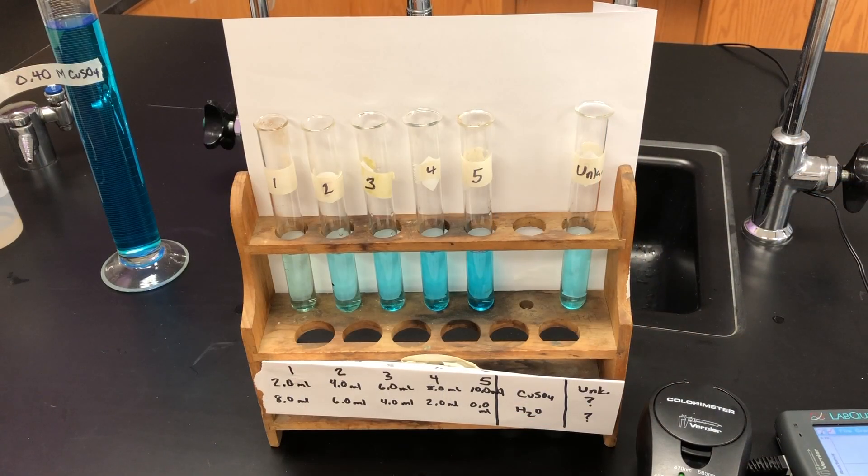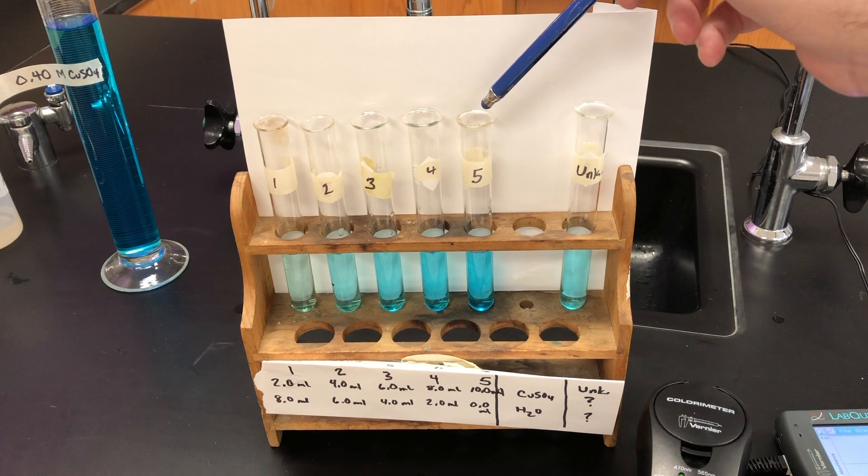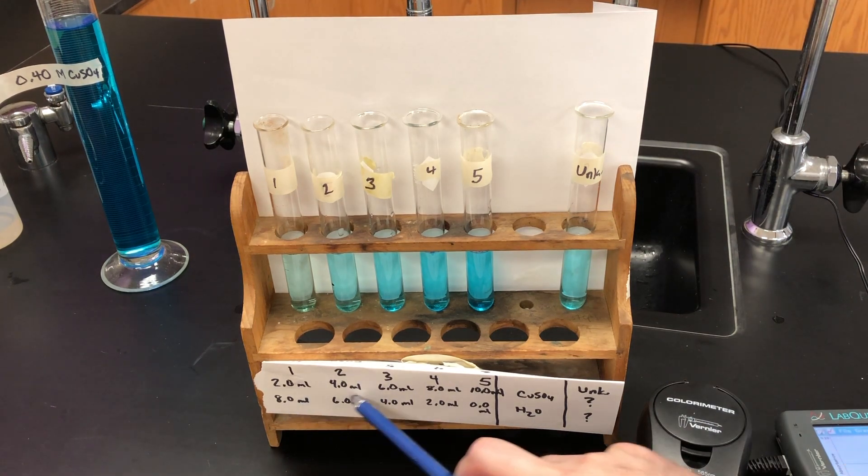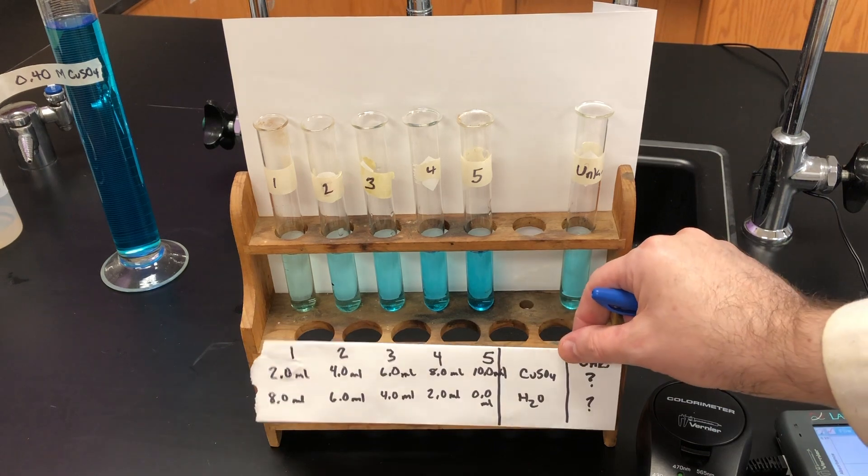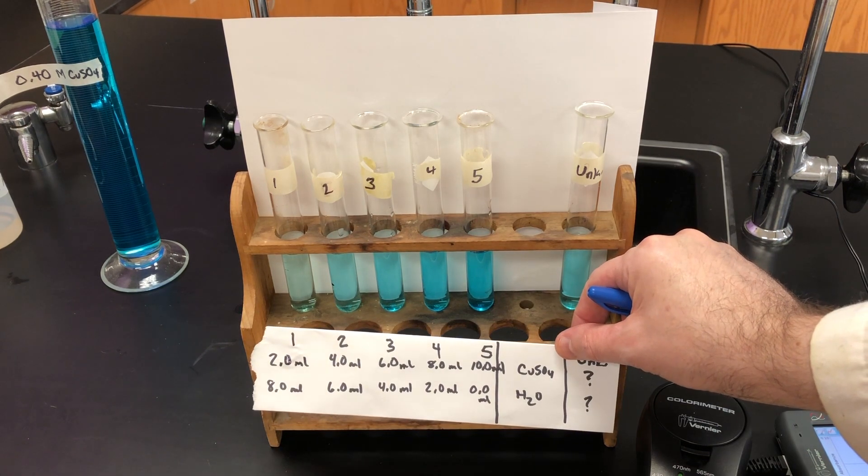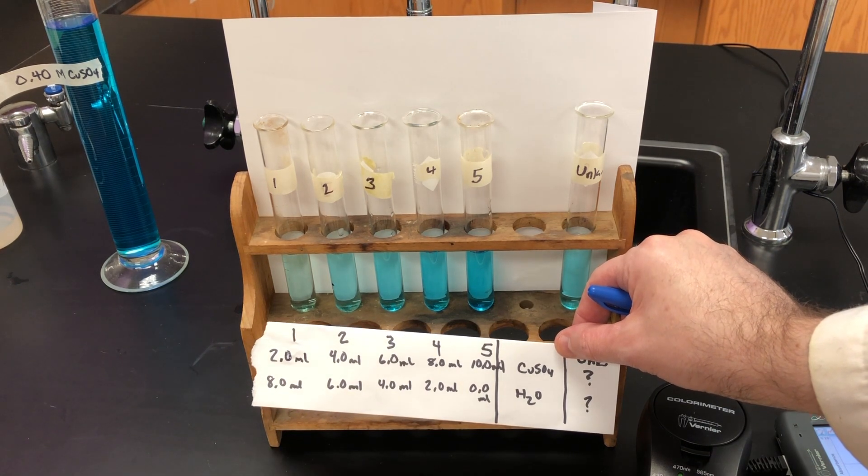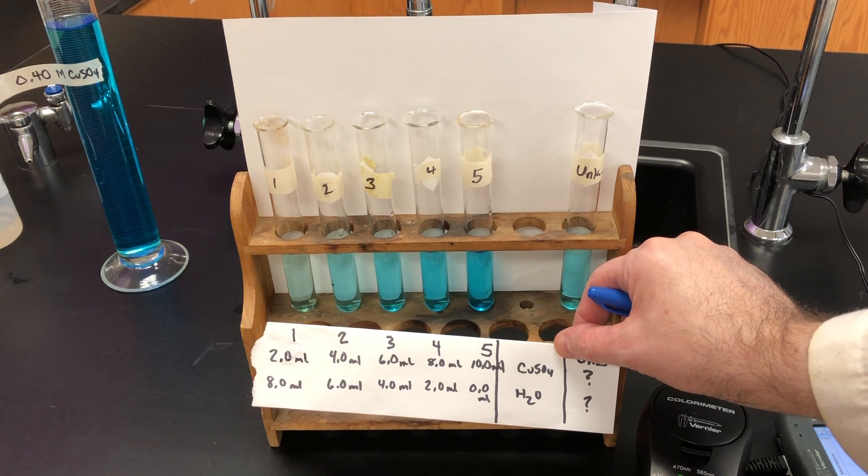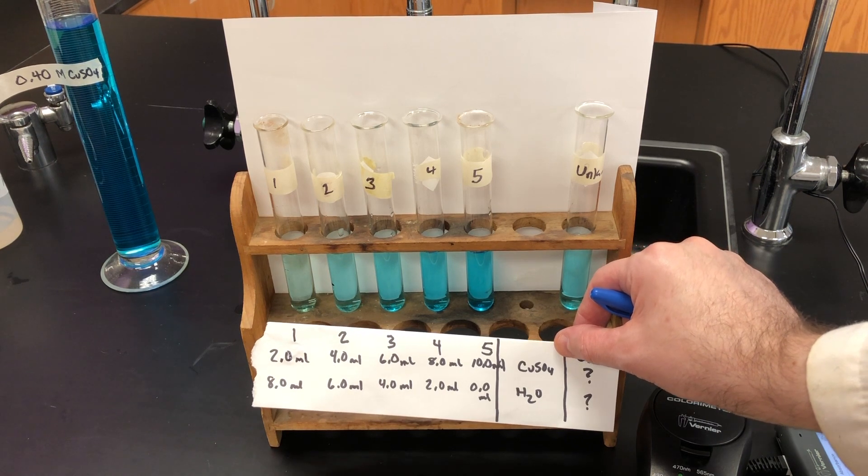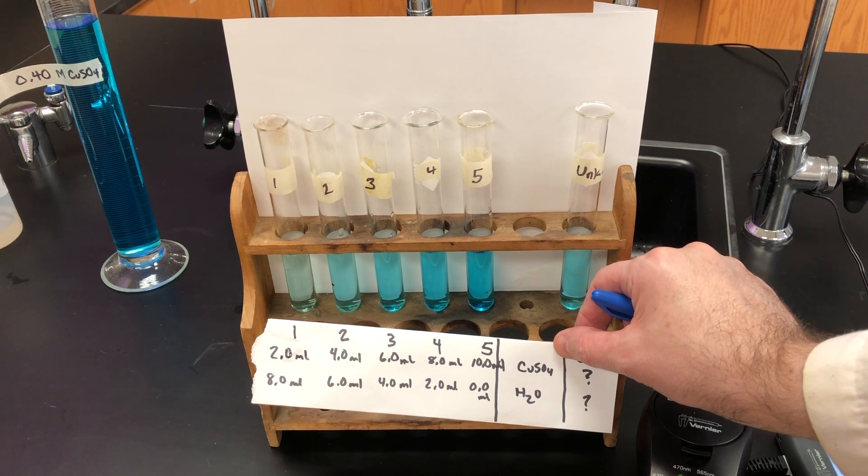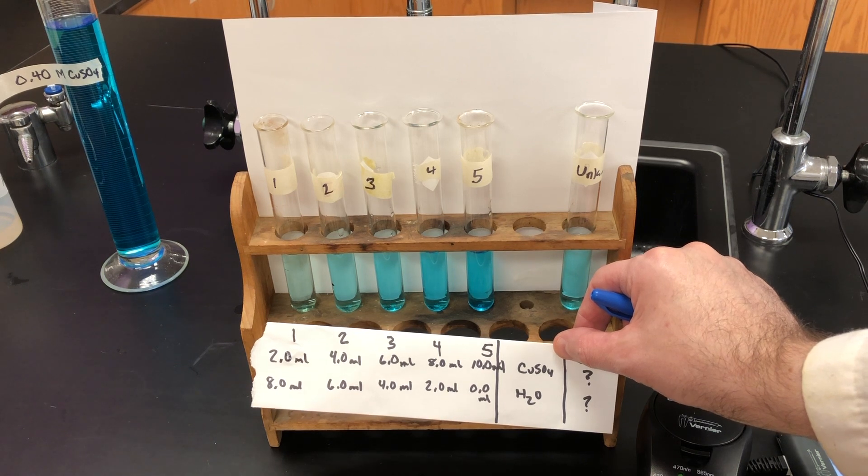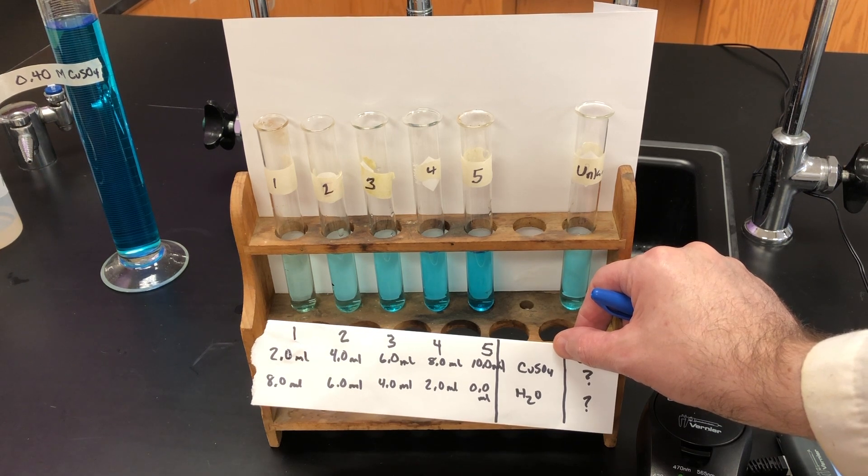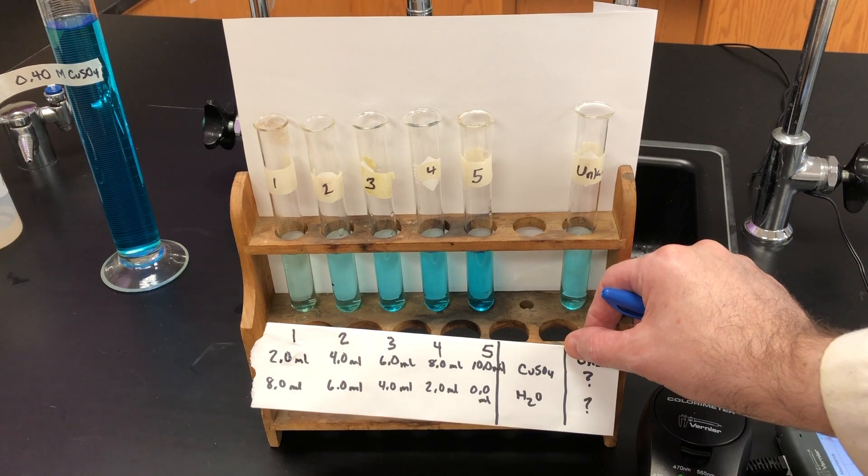We've made the solutions. As you can see, as you increase the amount of copper sulfate in the solution, you'll notice that the solutions get progressively darker, and that has to do with the copper sulfate that's in the solution. I also made an unknown as well, and you'll notice it's somewhere in between any of these. So now what we'll have to do is measure them, and we'll use the colorimeter for that. I'll demonstrate one of them and then show you the results when we're all done.